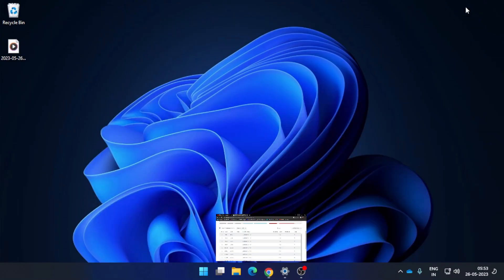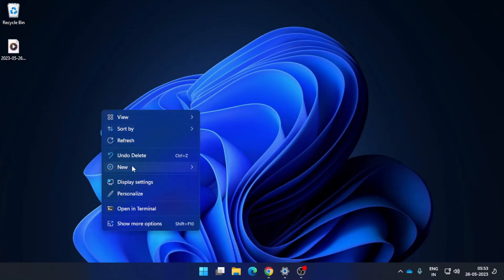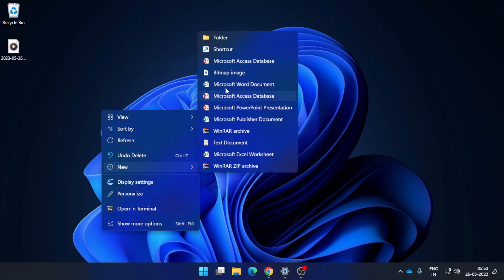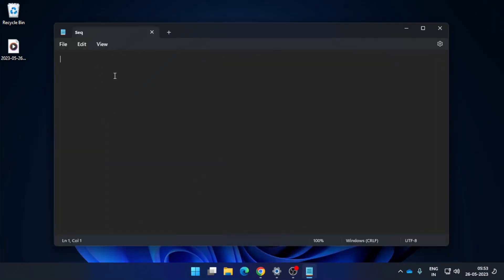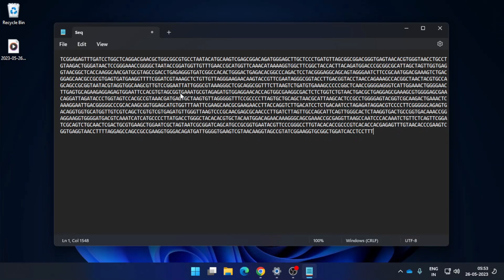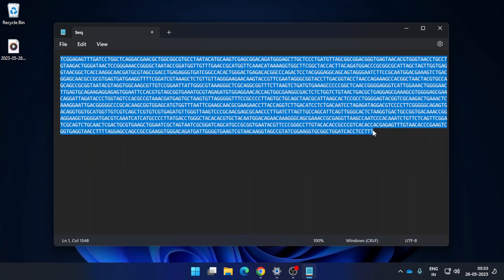Minimize this window and on the desktop create a new Notepad file — you can give it any name of your choice; I'll name it 'sequence.' Open this file and simply paste the sequence. This is the entire 16S rRNA gene sequence.